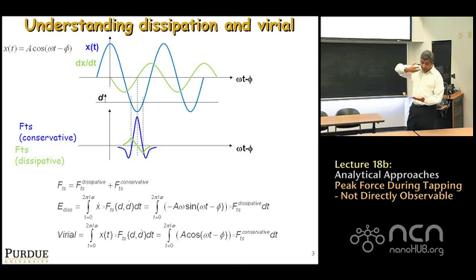At first, when the tip is approaching the sample, it's swinging low. You're coming down along the harmonic on the top. You're coming below. At first, you're going to experience an attractive force, right? Because the tip is approaching the sample, you have van der Waals forces. You're experiencing an attractive force. So as you march forward in time, the interaction force experienced by the tip, shown in blue in the graph below, starts to dip. It means it becomes more negative as you're approaching. That means more and more van der Waals forces until you contact.